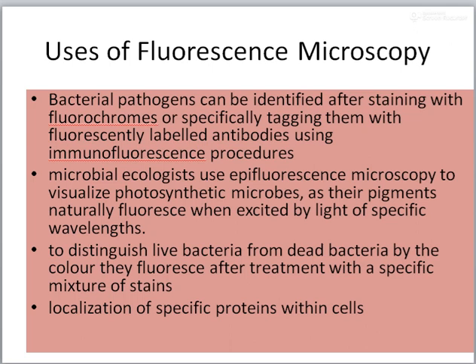An antibody is something formed by your body against an antigen. On the surface of a bacterial pathogen there are certain surface molecules, which are considered antigens. The antibodies specific to these bacterial antigens are synthesized in the laboratory and coated with fluorescent molecules.